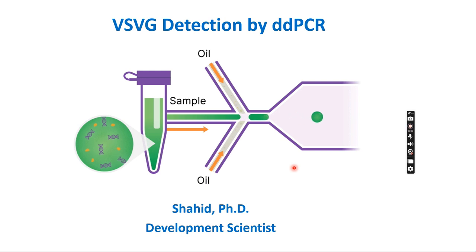Today, I want to talk very briefly about ddPCR and how you can set up a very quick ddPCR for VSVG detection.